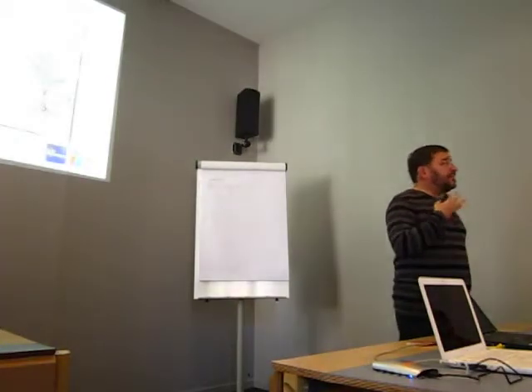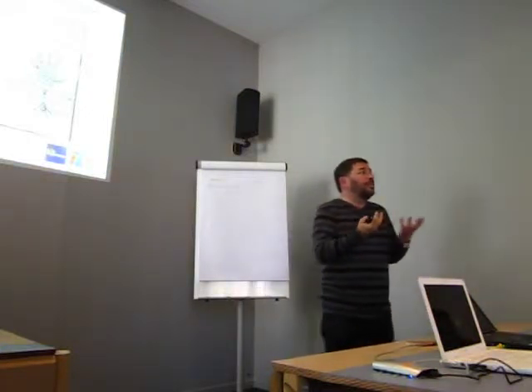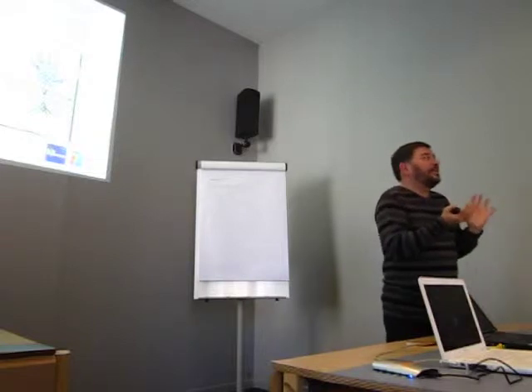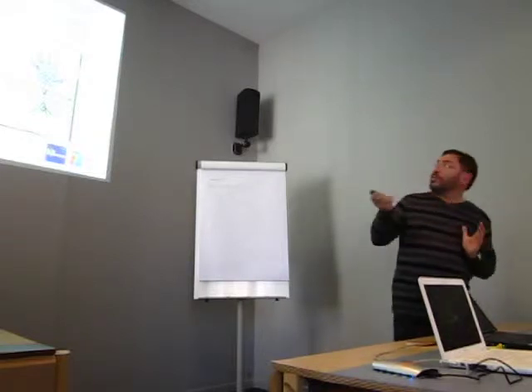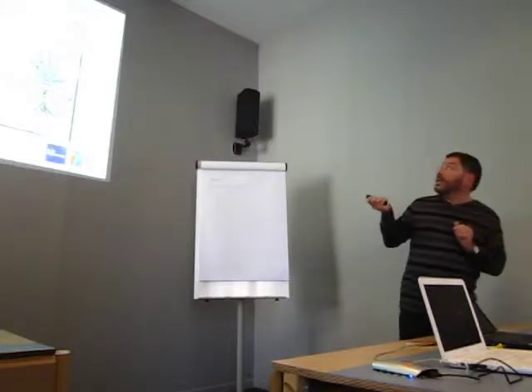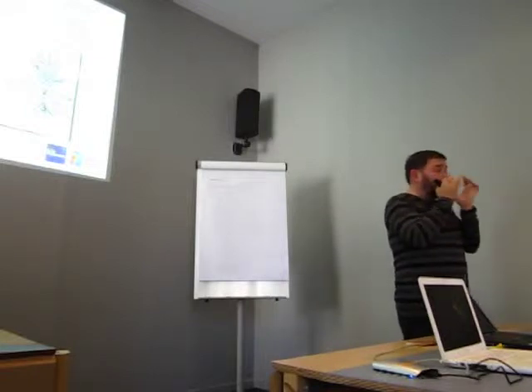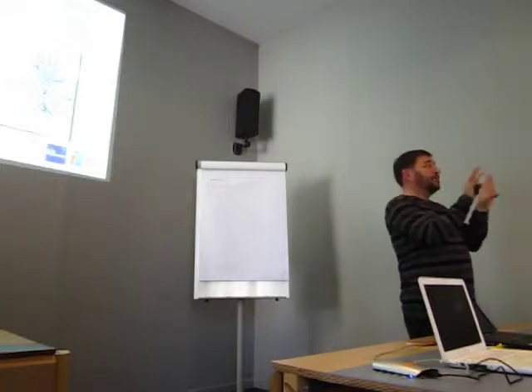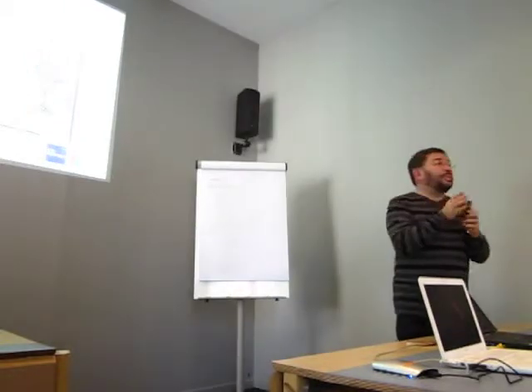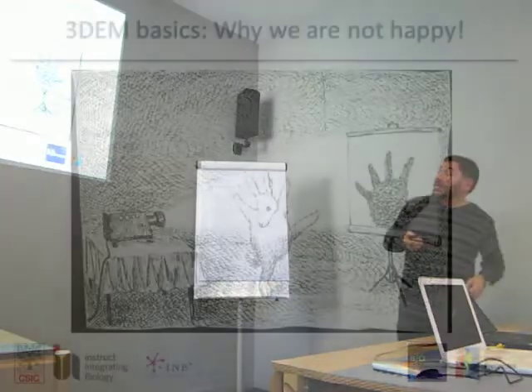Okay? Intrinsically, from one 2D image, you cannot recover 3D. Because this is like gaining one full dimension for free, and this doesn't exist in life. So the single way to get this 3D structure is by combining many 2D images. And this is very obvious. You don't know how big my nose is if I am just talking to you like that. I have to be sideways, and then you start seeing how big my nose is.